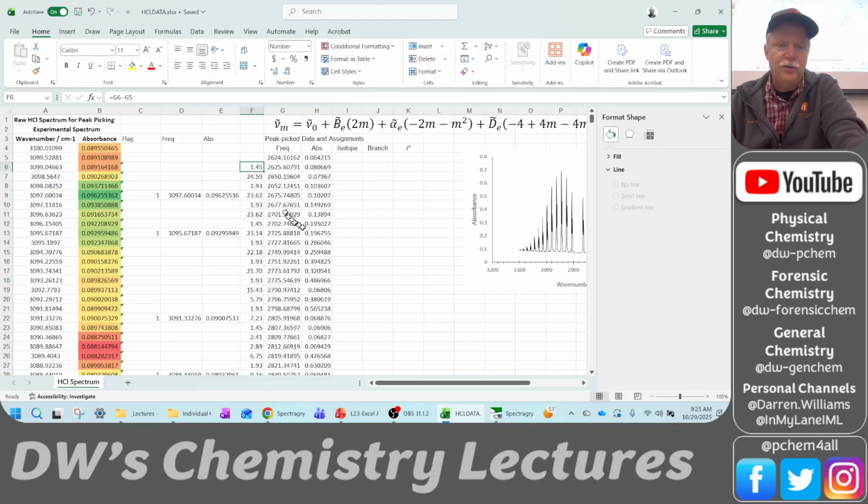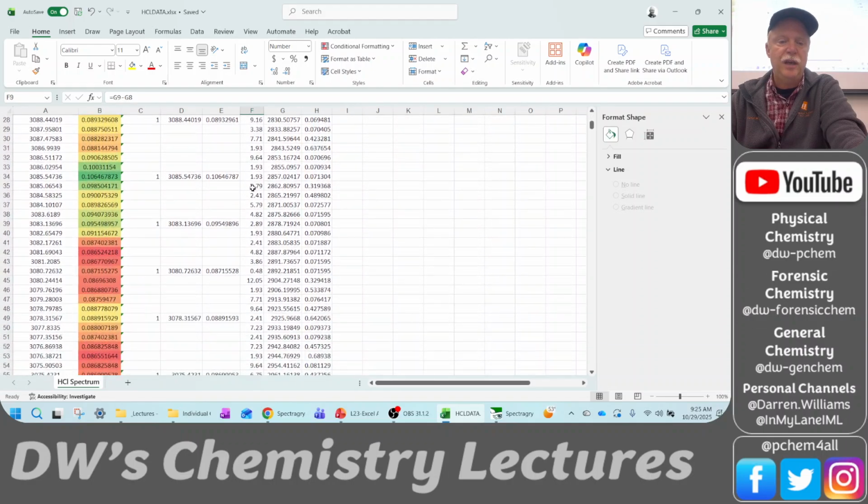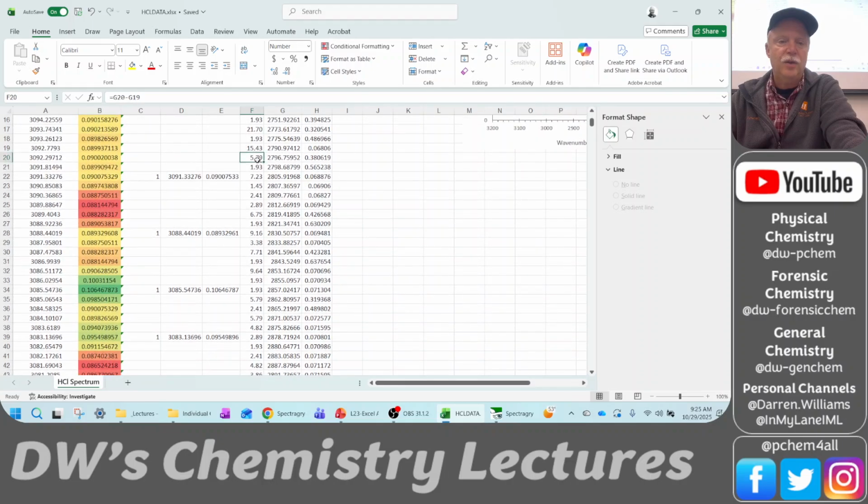This is the difference between two isotopes, and this is the difference between two rotational lines. And we immediately see a pattern, don't we? We see an isotope difference, rotational line difference, so like the difference between two R lines or P lines, okay? And so look, in this region we start to see a kind of a mess. So a lot of these right here are bad.